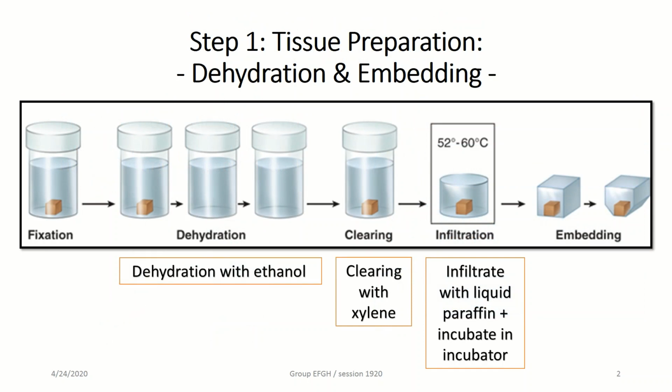Next, for dehydration and embedding, the tissue is dehydrated in sequential baths of ethanol and xylene, which is the clearing step, and then it is infiltrated by molten paraffin. This maintains structural detail by infiltration with the matrix, which is typically paraffin. Then it is embedded. Other tissue processing methods include snap freezing, where the tissue is embedded in gel and cut in a cryotome after quickly freezing on dry ice to minimize the damage.